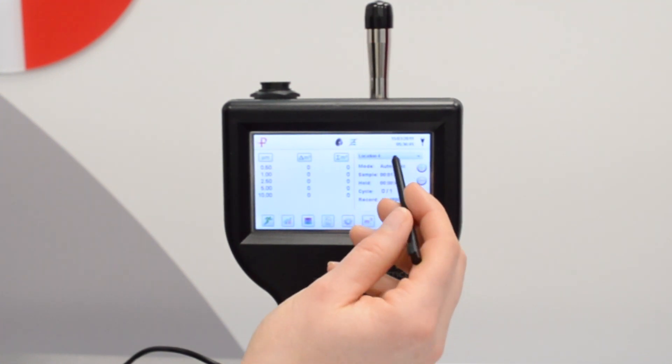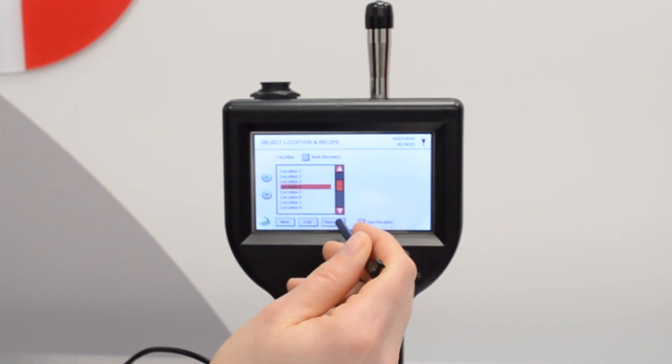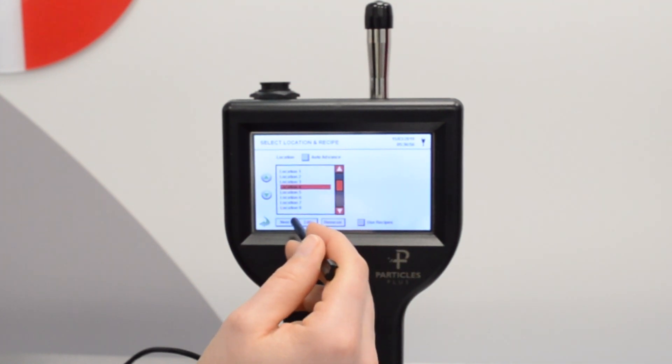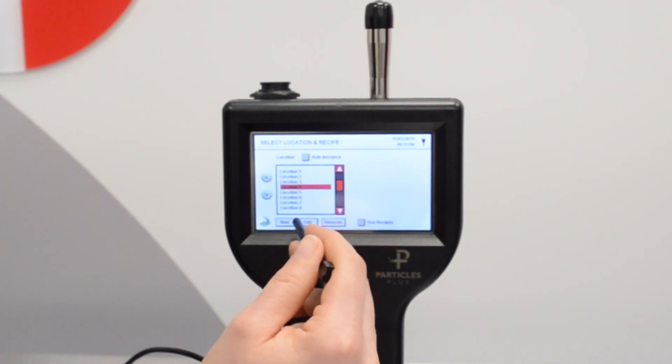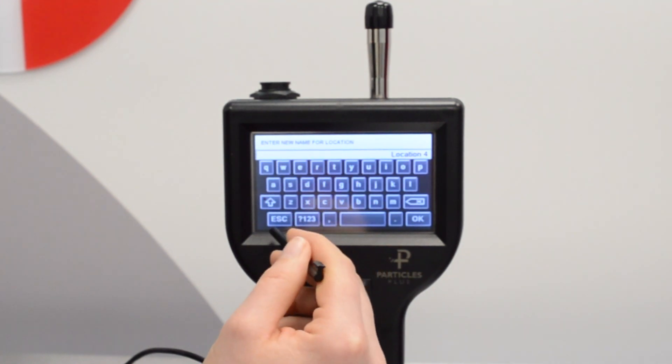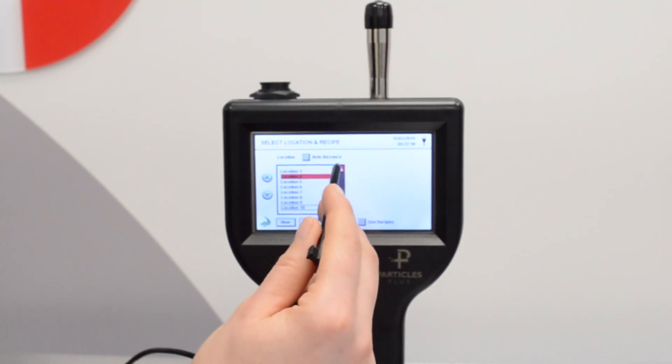From the home screen if you select the location drop down you will see 10 locations listed. If you need to add a location select new, which brings up a keyboard allowing you to name it. Select okay to save. If you need to edit the name of a location highlight it and click edit. To change the order of locations highlight the location and use the arrow keys to move it up and down.